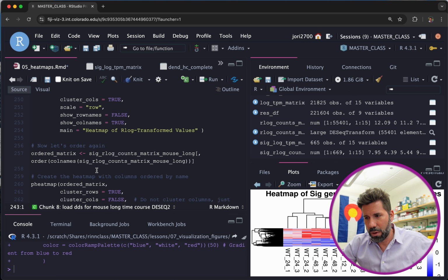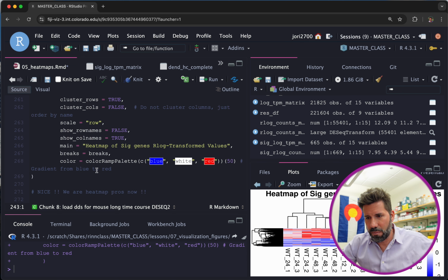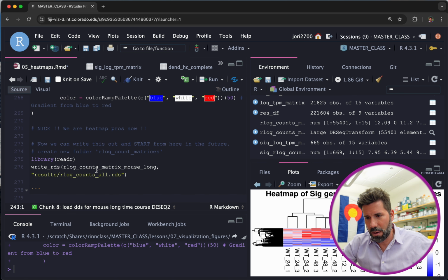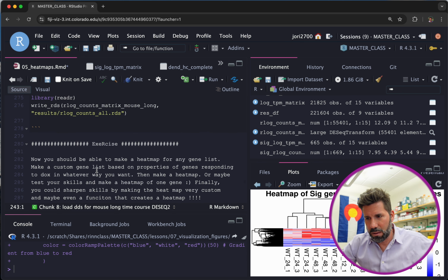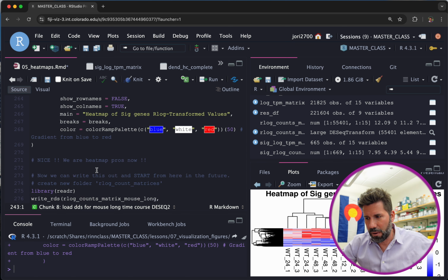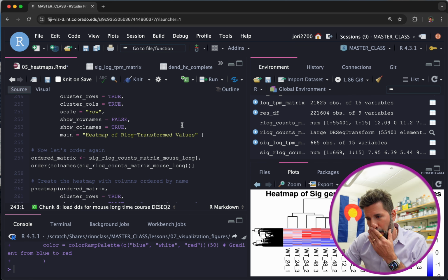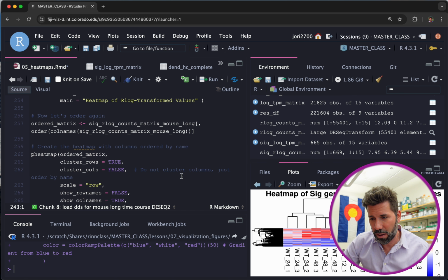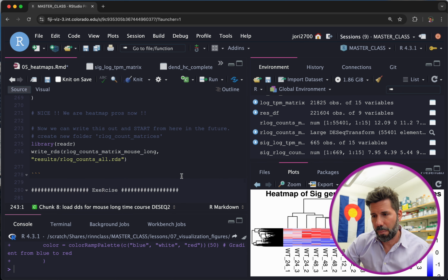And so I think we should just leave it there, because this is just reordering things, and we don't really need to do that, but if you want to keep going here after line 200, what it's doing is simply ordering these in the actual time points. Again, it's not cheating, but makes it a little easier if you were to make a figure.